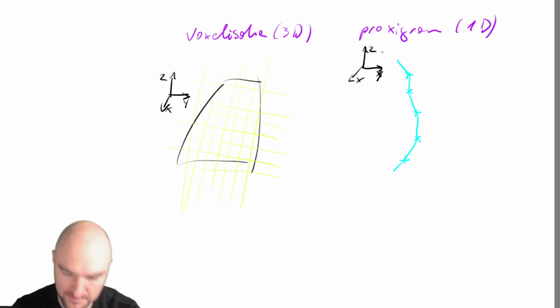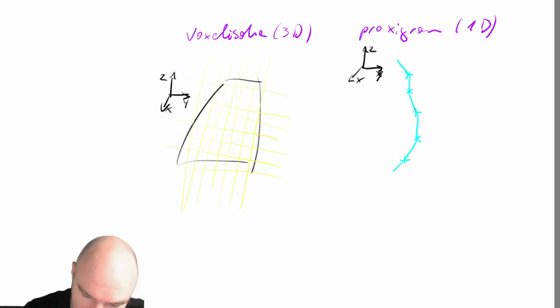So we have our x, y, z, but this is not what we're using here. What we're doing is taking our surface normals n, which exist for each vertex or for each face, depending on which way you want to approach it. They all have a length of 1, by the way. I'm just drawing them in different lengths.